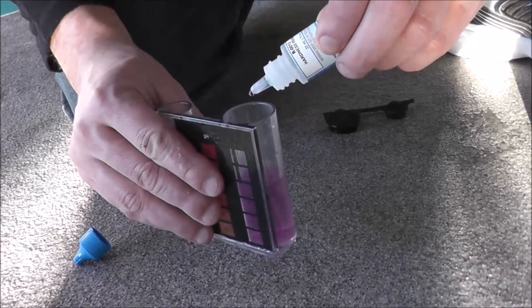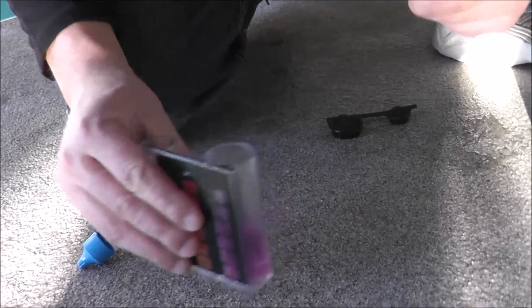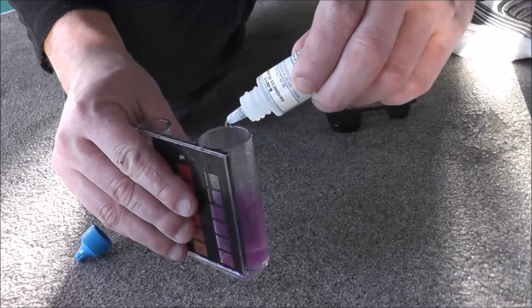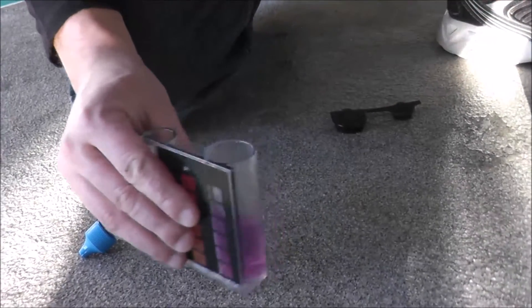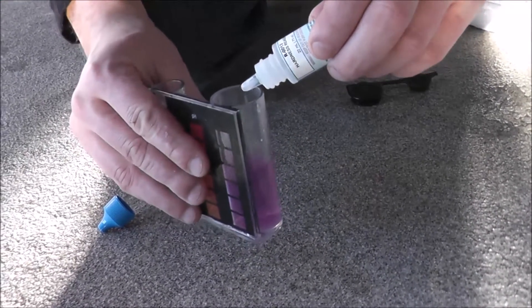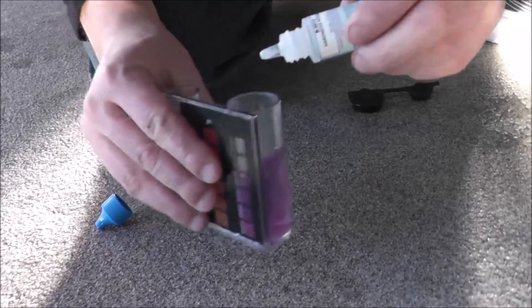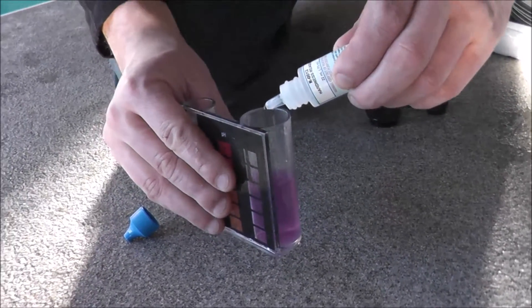Adding them one at a time now: 110, 120 parts per million, 130, 140, 150 parts per million. It's starting to change color here — 160, 170 — keep swirling — 180.